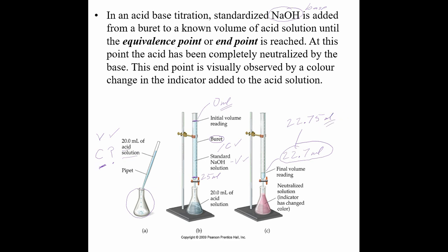So how do you know when that reaction is complete? Well, when we have neutralized the acid with the base solution, we refer to that as the equivalence point or the end point, but it really is when the neutralization has taken place. So how do you actually tell that this neutralization has occurred?